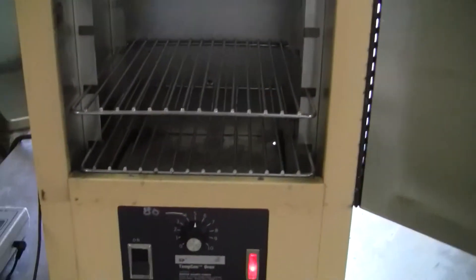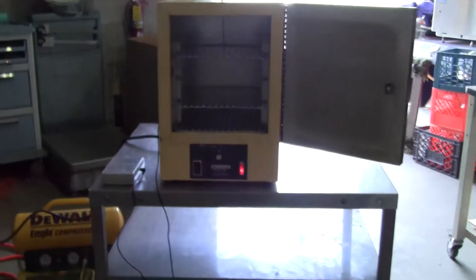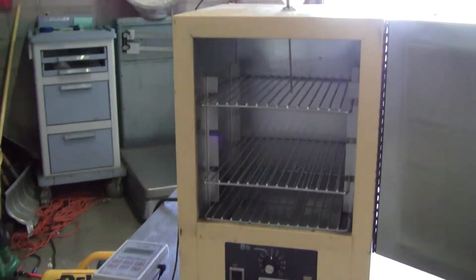Let's take a look inside. It's got three shelves inside, pretty clean. It's got interior dimensions of 11 inches length, 10 width, and 12 inches high.